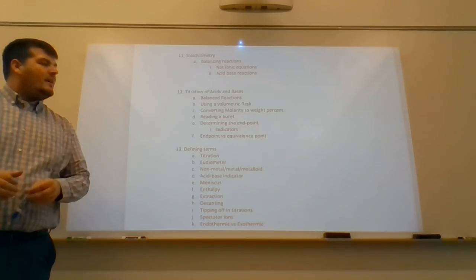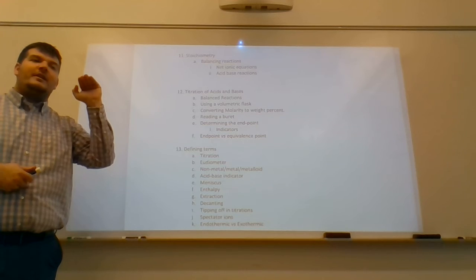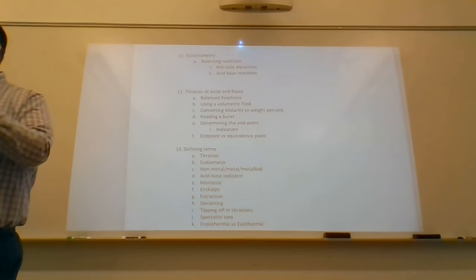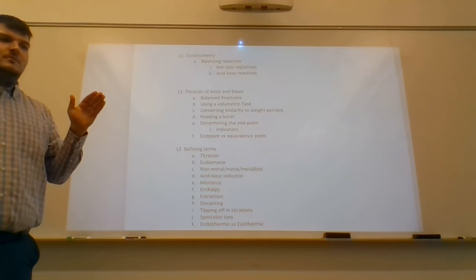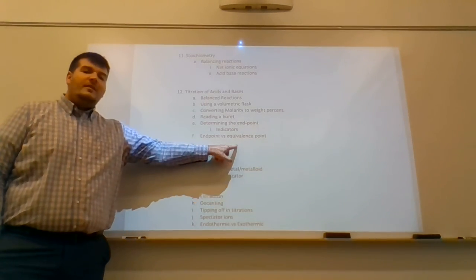Okay, so that's what changes colors. Phenolphthalein at whatever pH. The end point is the pH at which the indicator changes colors. Okay? What is the equivalence point?